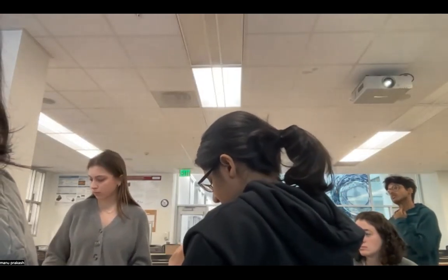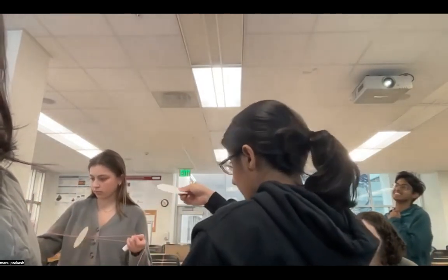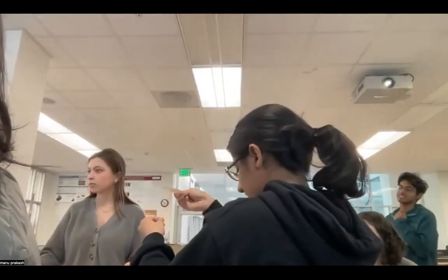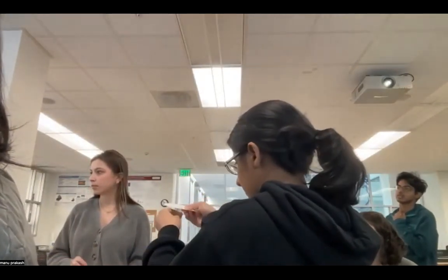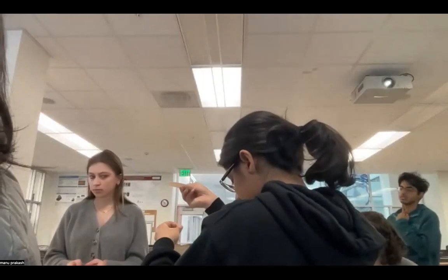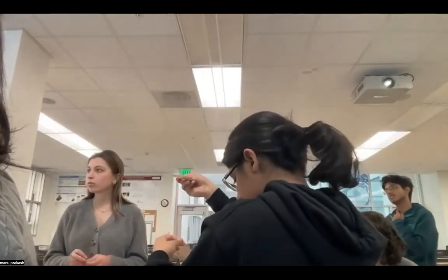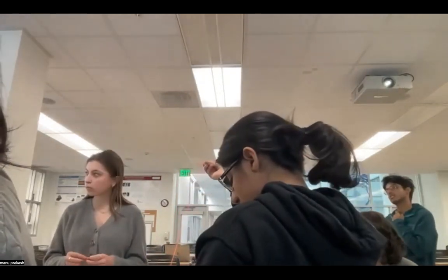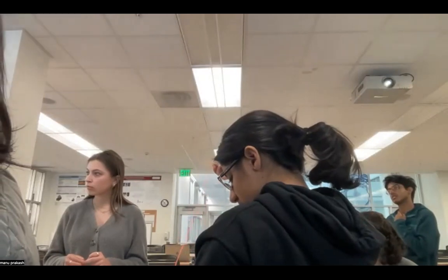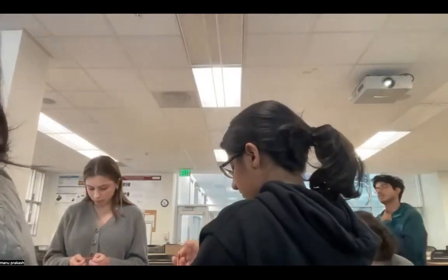You would get a flickering signal, right? So now you have flickering light, and now you have to measure that. You've converted something spinning into flashes of light. So how would you measure? You still need to find the spacing between those flashes. Yeah, I guess you get a receiver and you're tracking time with a running clock.